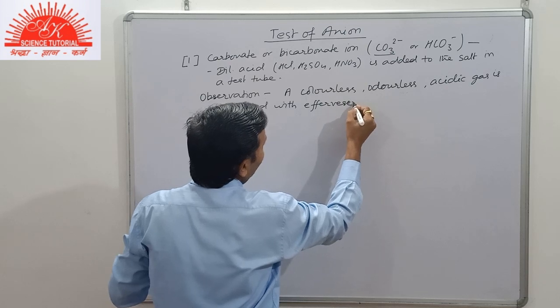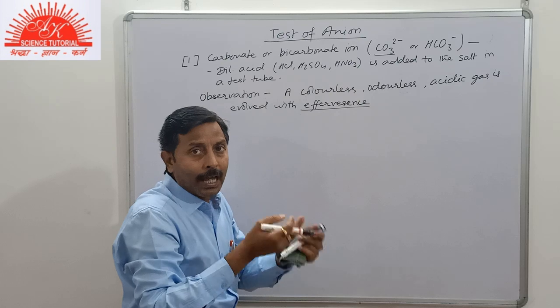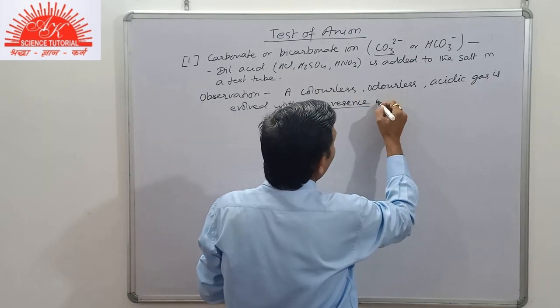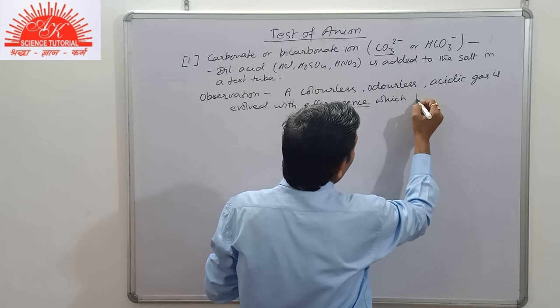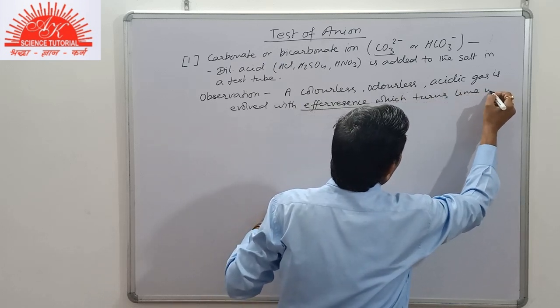Effervescence we have studied in the previous topic, that is with bubbling, rapid bubbles will be formed. With effervescence, which turns lime water milky.